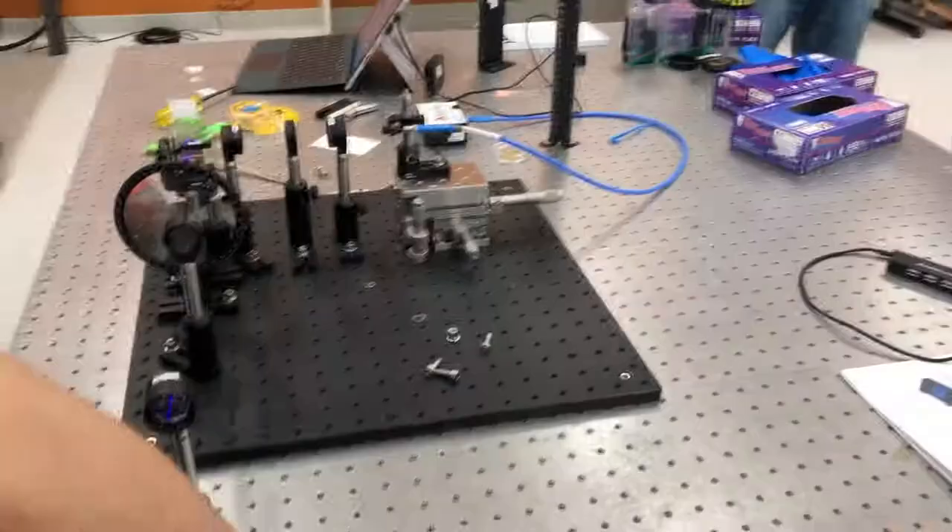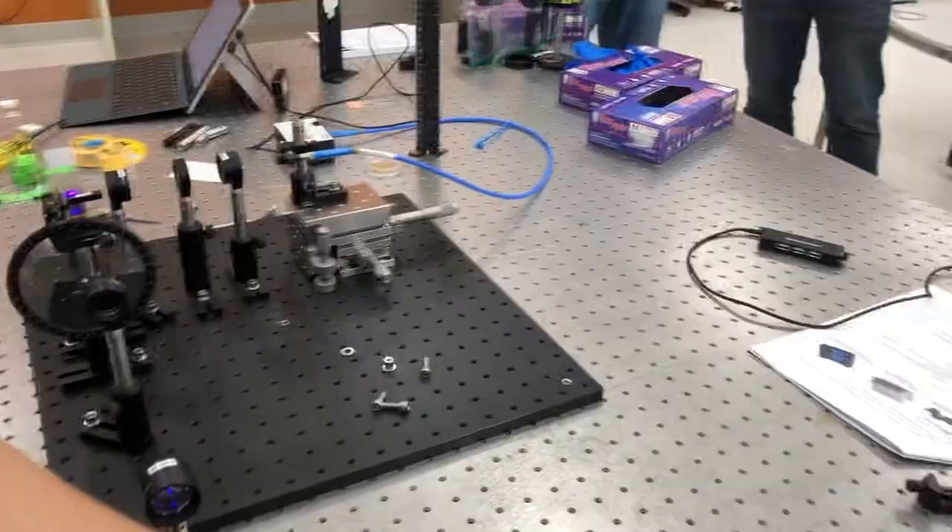Once the optical setup was ready and all safety equipment was put on, we would turn on the laser, allowing the light to shine onto our samples.